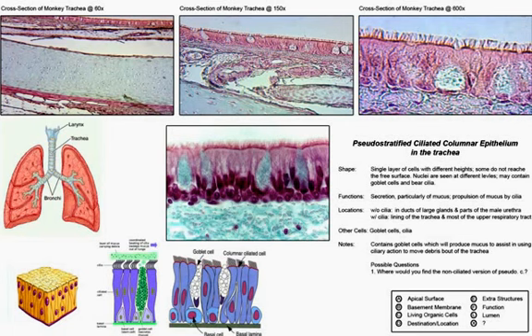Okay, the cells at the basal membrane, or the basement membrane, the basal lamina, since this is a mucous membrane, would be more cuboid-like because they're mitotically dividing, they're younger, and they haven't quite reached the size and the quantity of the cytoplasmic material within them as a mature cell would have, seen here.